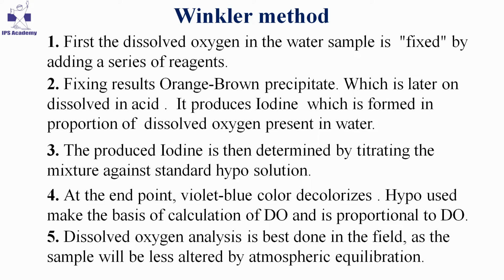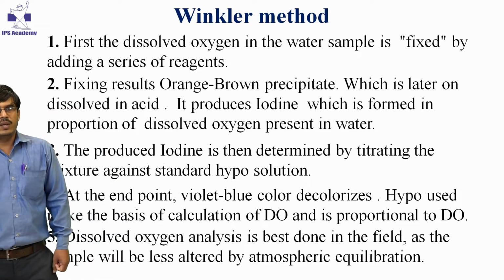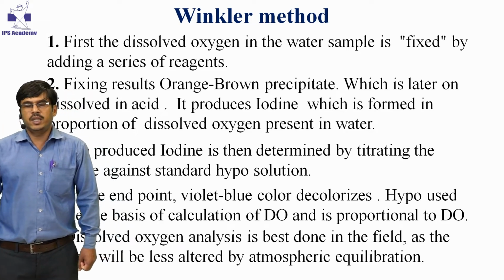So when we titrate with hypo, the concentration of this complex decreases as it decomposes, and near the end point the blue color decolorizes.